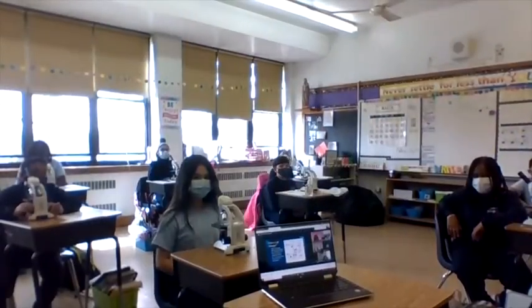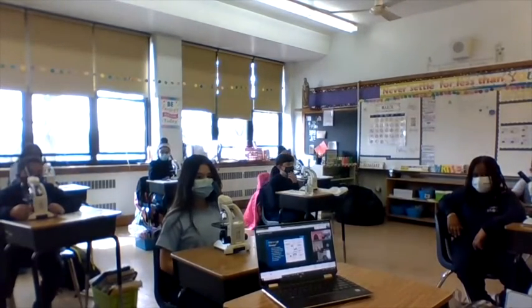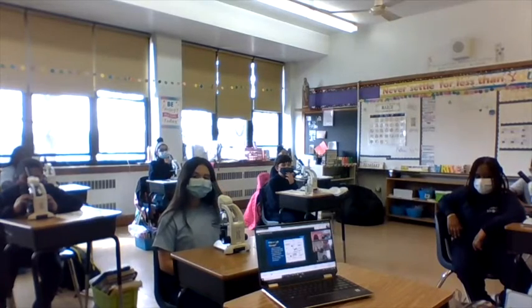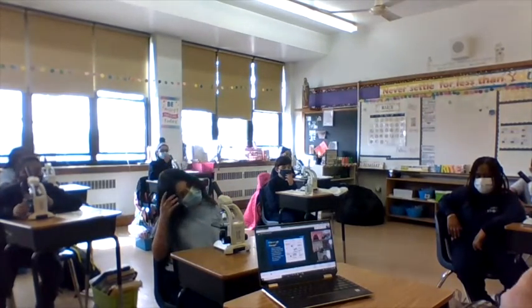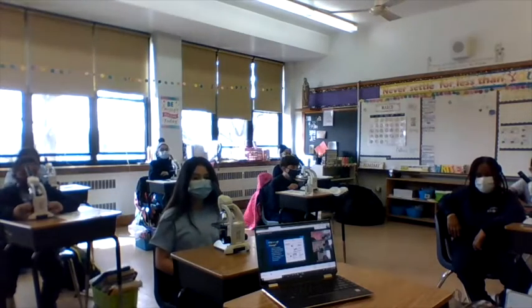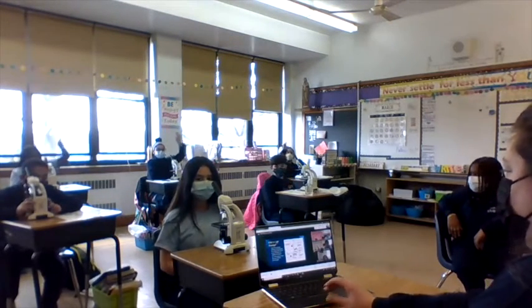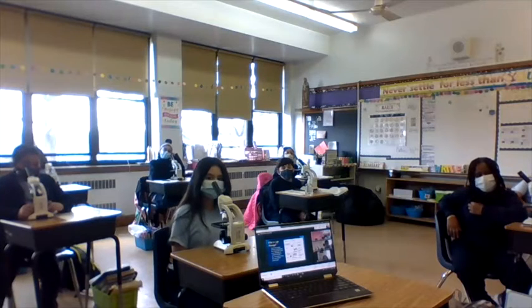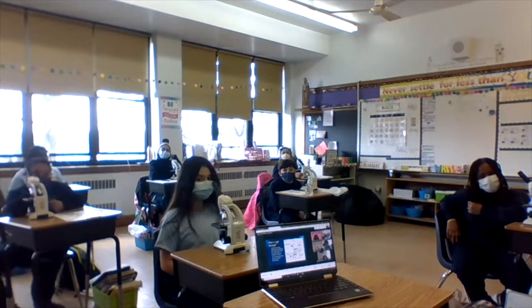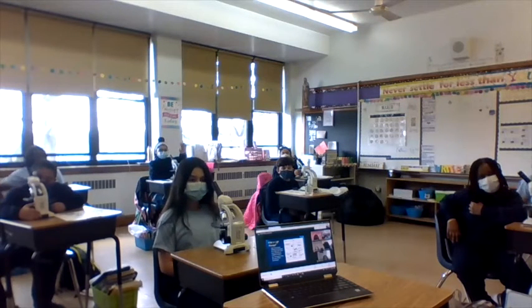Okay, so now for the second part of today's lesson, you're going to analyze a specimen. Say analyze a specimen. And the specimen that we gave you were a stem, say a stem, and a plant leaf. Why are we analyzing stems and plant leaves? Ariel at home, can you tell us why we're looking at those? Why are we looking at plant cells?